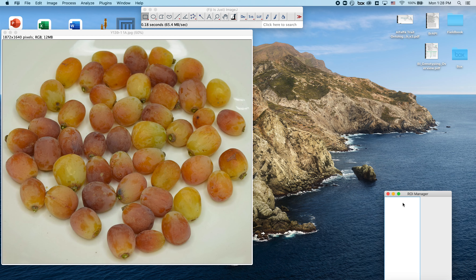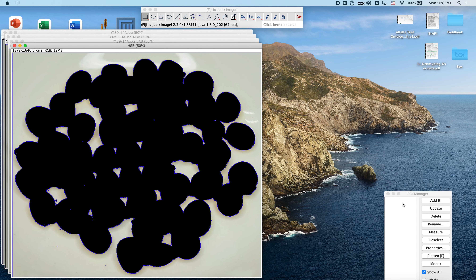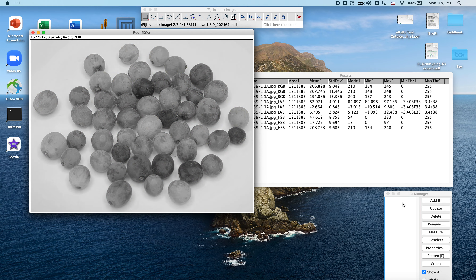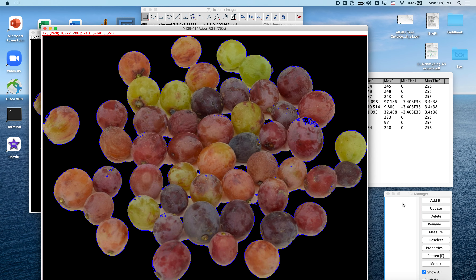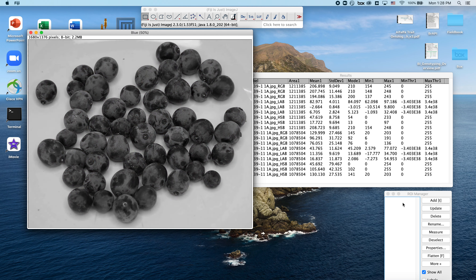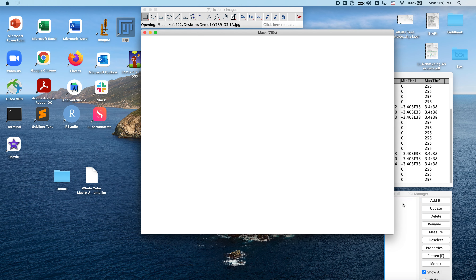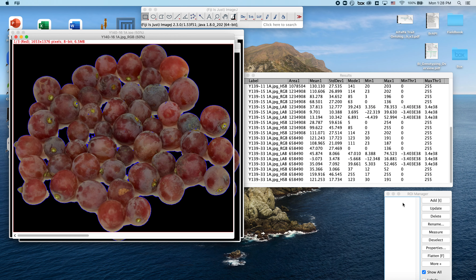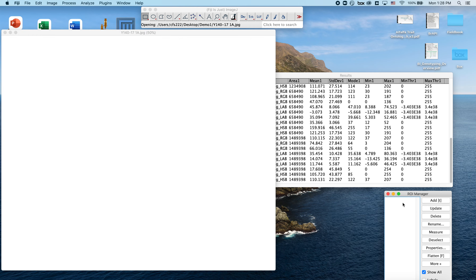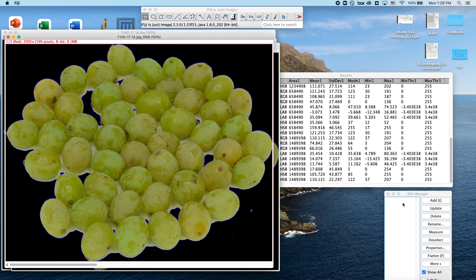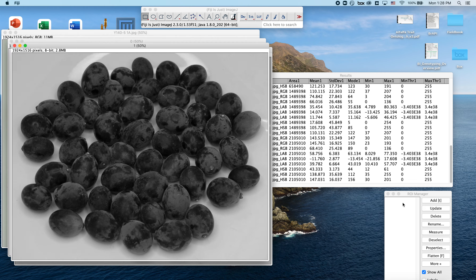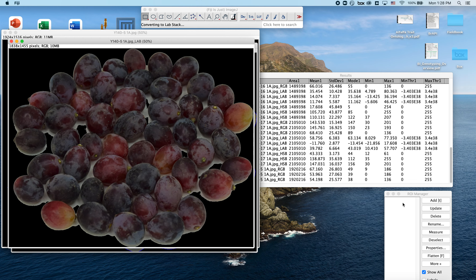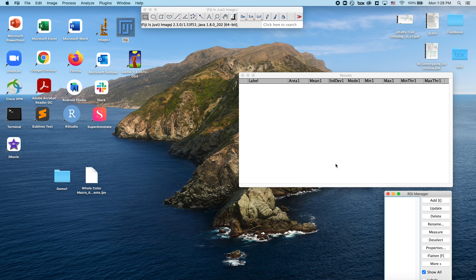So I'll go ahead and hit Open and it should begin running — opening the first image, thresholding, segmenting, collecting data, moving on to the next image. It seems like it made a mistake on that first image and identified the berries as the background, but hopefully all subsequent images should process well. We can see it's moving through these steps very quickly — breaking everything down into different color spaces and different channels, extracting all the data, which you can see posted in the results. That was the last image in the folder, so it's wrapped up and exported the data as a CSV file.